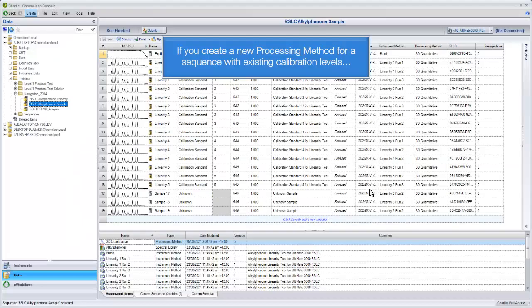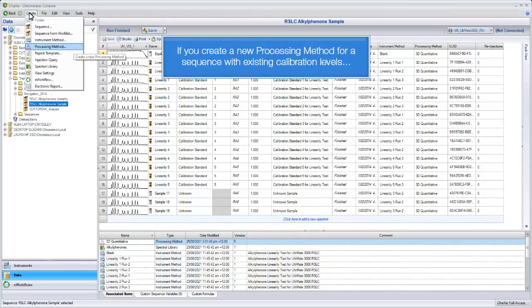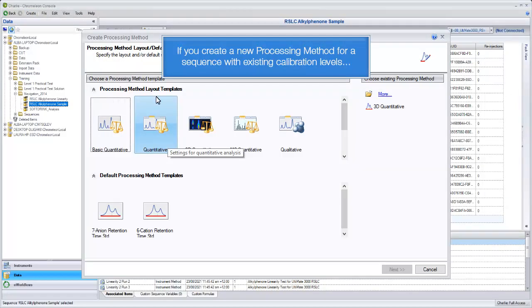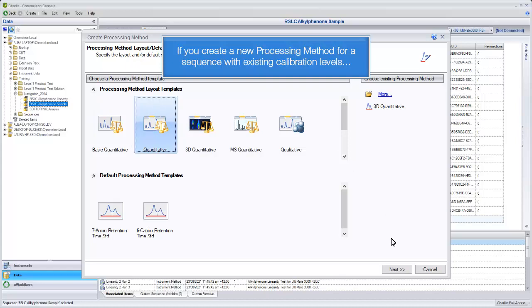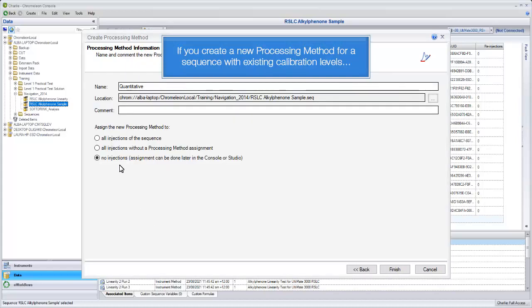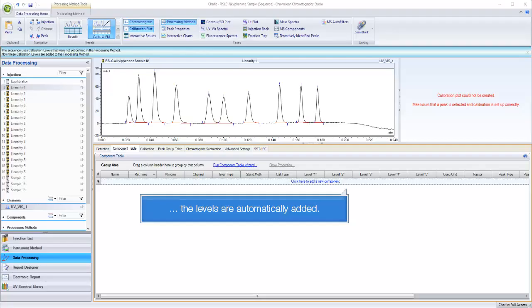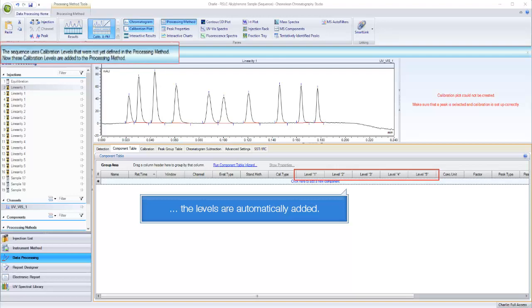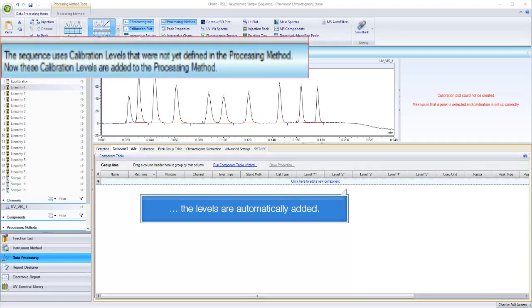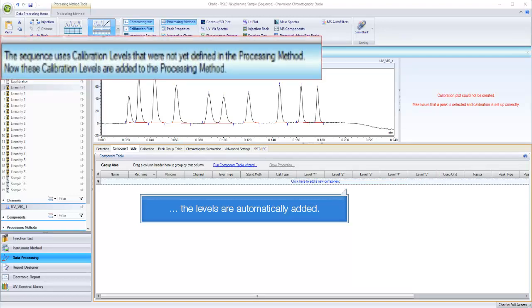If you create a new processing method for a sequence with existing calibration levels, the levels are automatically added. The blue bar advises the calibration levels are not yet defined in the processing method.